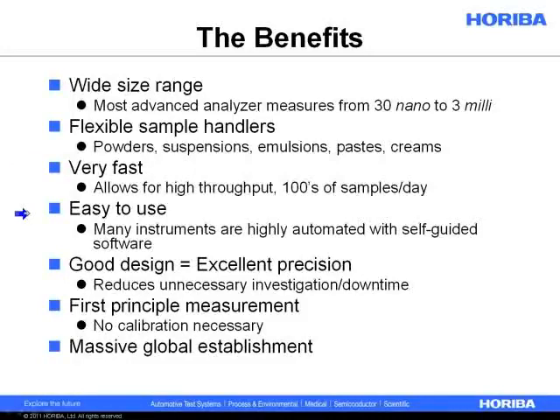Again, it's very easy to use. Modern instruments now have to be highly automated to compete and to be attractive. And the best instrument should come with some sort of self-guided software, and it's all about troubleshooting. When you run into a problem, you want to be able to self-medicate, so to speak, right? You want to be able to understand what the problem is and fix it yourself rather than relying on the vendor, which may not be able to respond to you as quickly as you'd like. And most people want instantaneous responses, right? So it's easier if it's just popping out of the software.